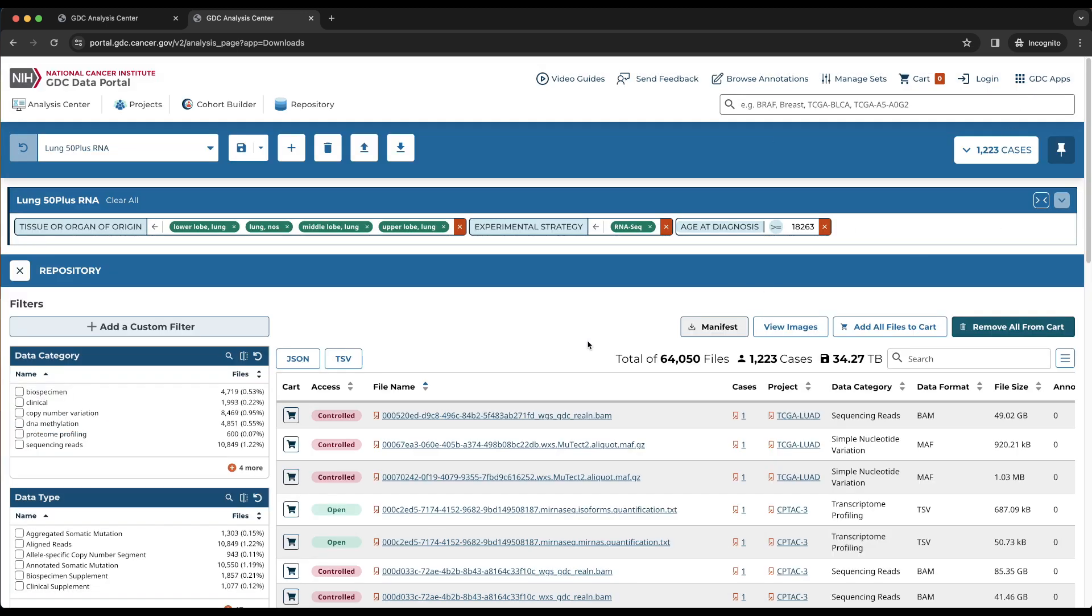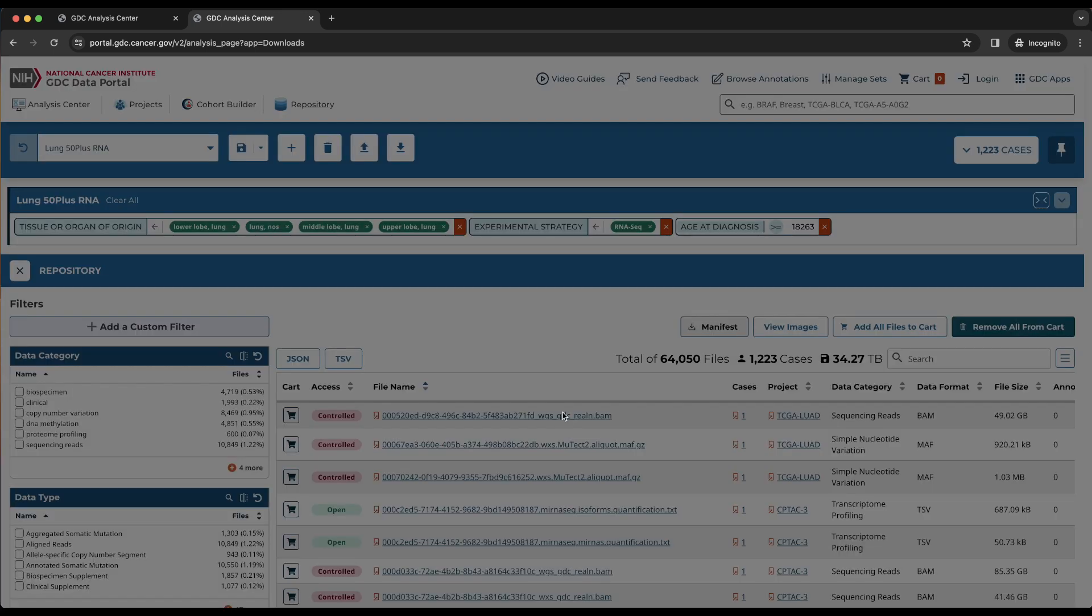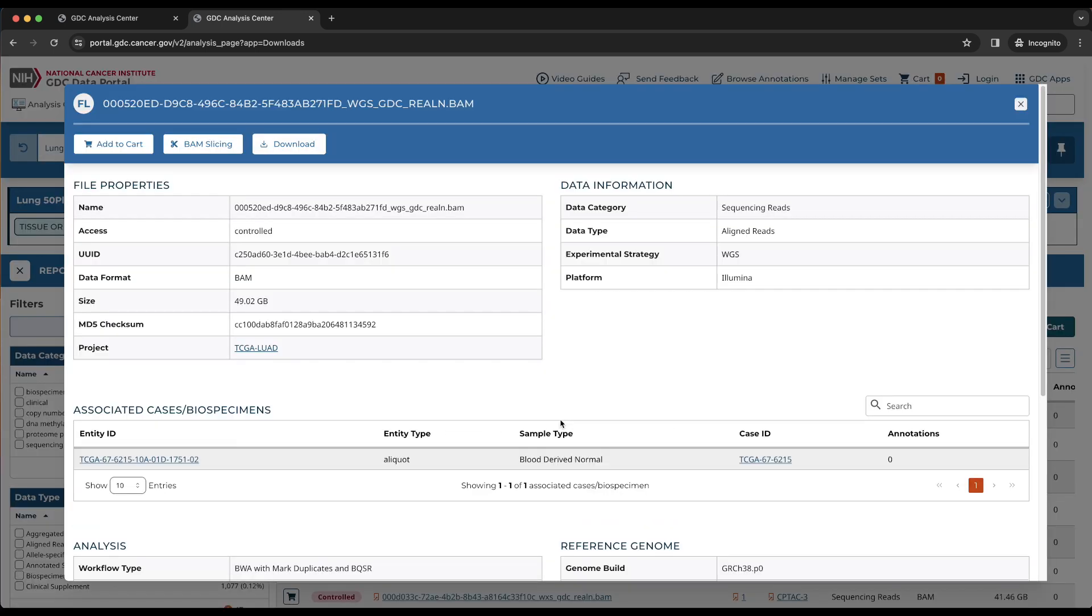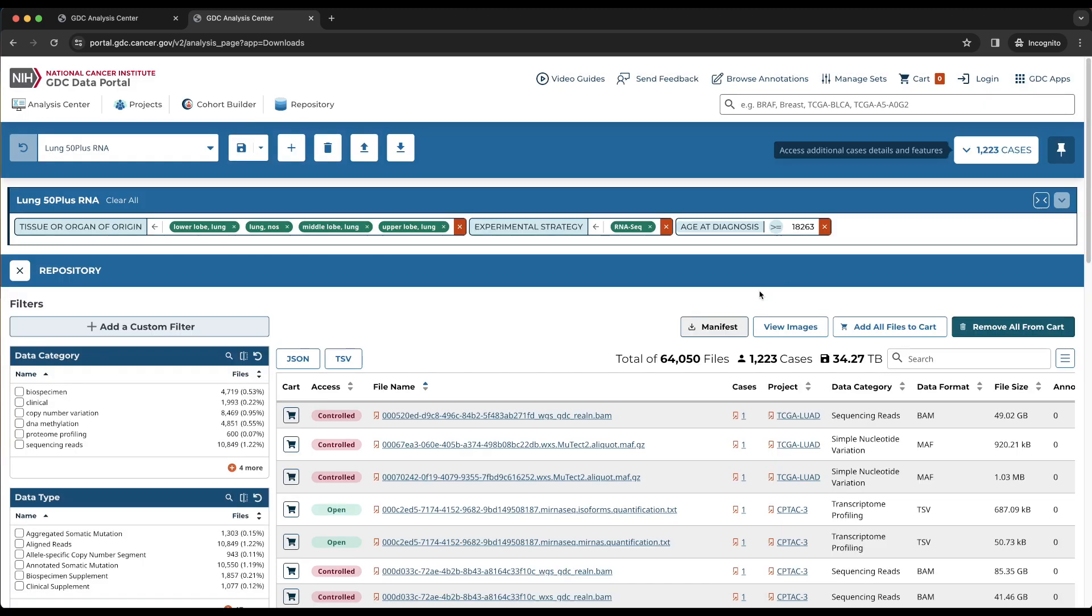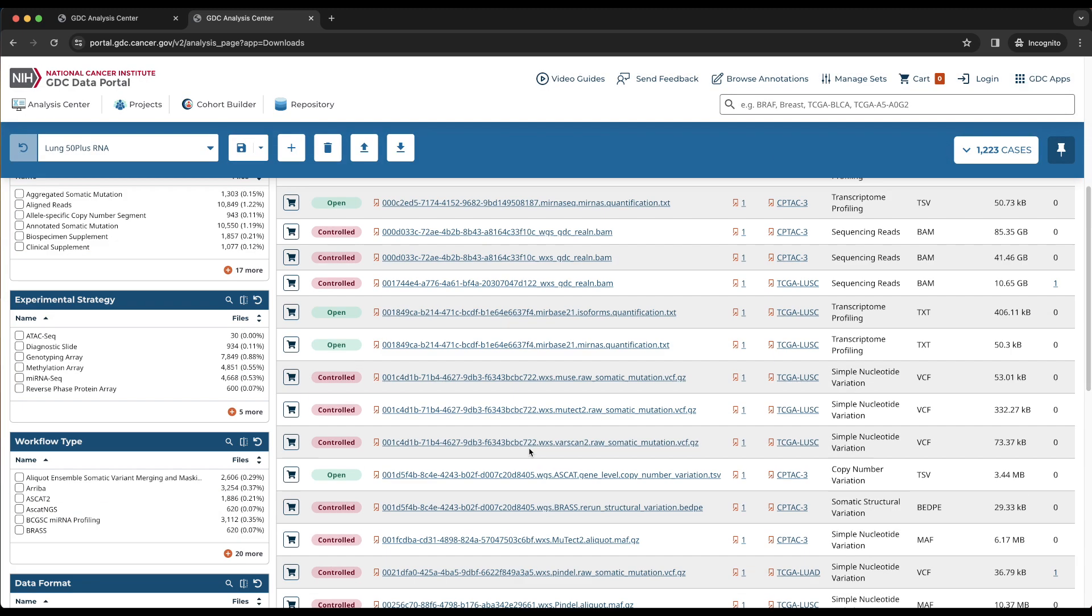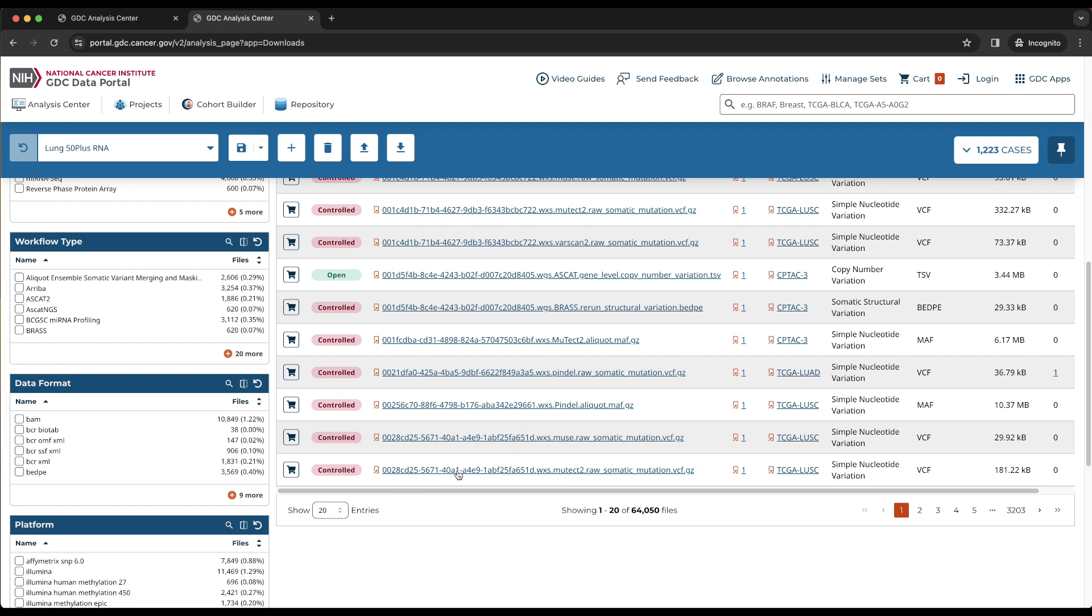Clicking the file name will bring up the file entity page popup, which displays details about the file, including the biospecimen entity, such as the case or aliquot that the file is associated with. The dropdown at the bottom left of the table allows us to select the number of files for each page or browse to a different page.